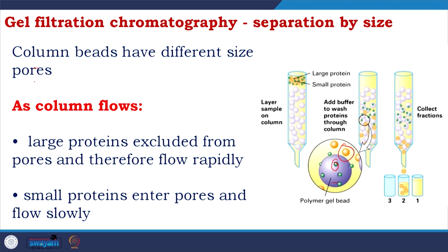This is a very funny situation, you know. Entire life you know that if you are overweight, you reach slowly. Who is underweight, they could run faster and they could reach quicker. Not in size exclusion chromatography. Here they have an amazing condition.